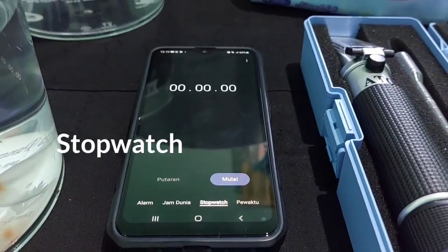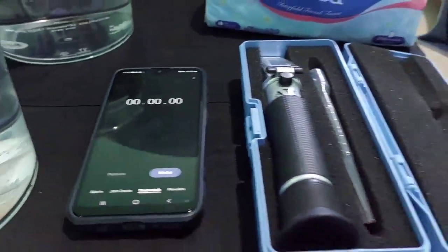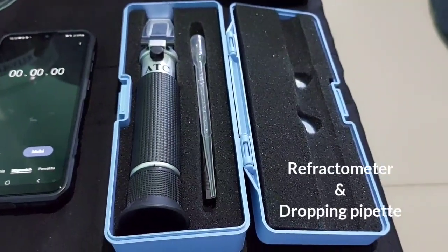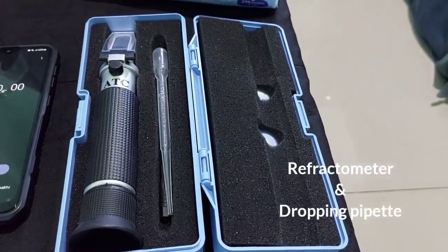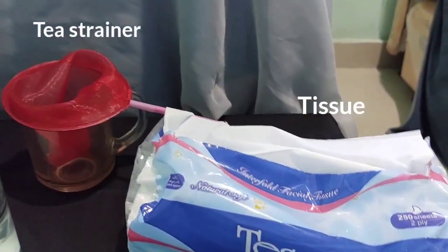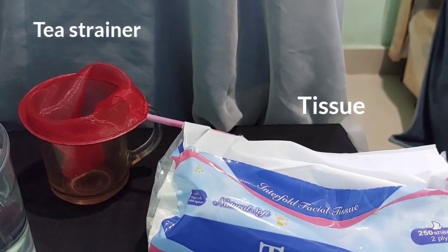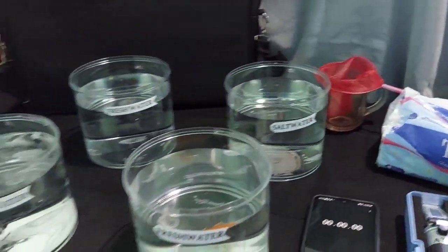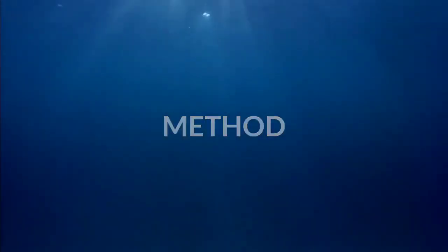A smartphone as a stopwatch, a refractometer, and a dropping pipette. Some tissue and a tea strainer. Then we move to the method.